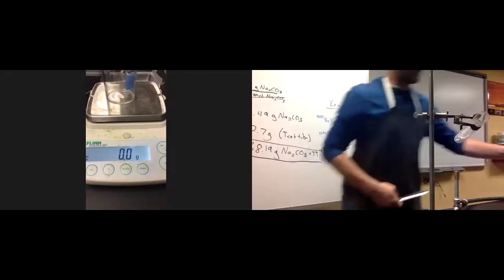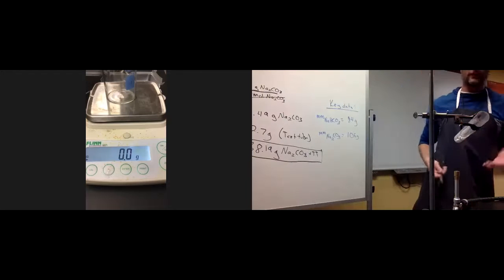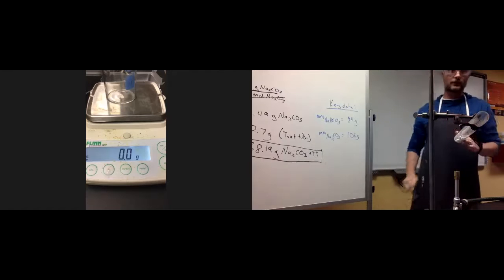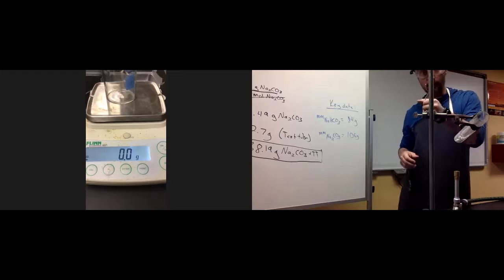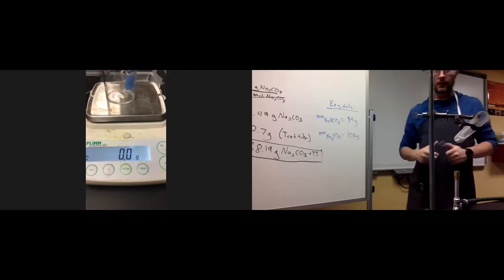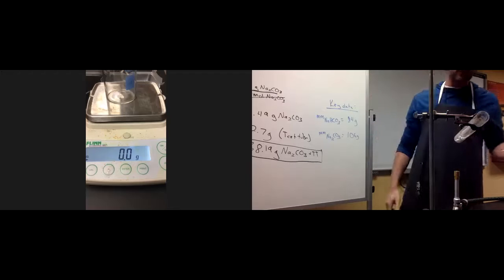So I'm going to turn the gas off, and I'm going to let it cool down for a second. I've got test tube holders, but still, I want to make triple sure that I'm safe. If something were to happen and I were to drop it and try to catch it, I would burn myself. So I got to be extra safe at all times. So let it cool for a minute.